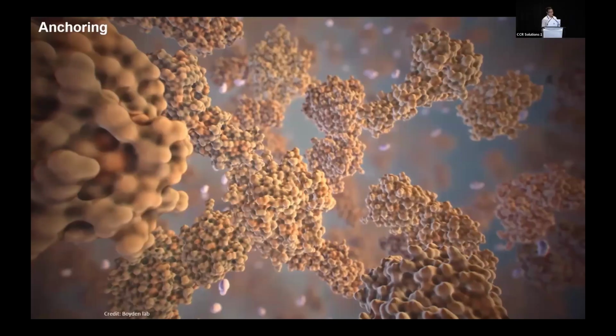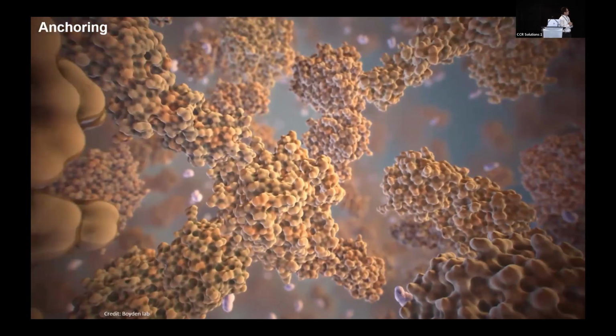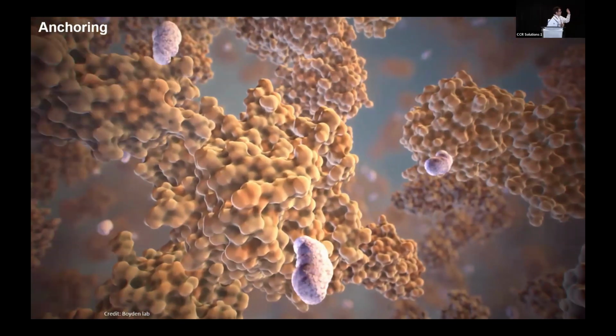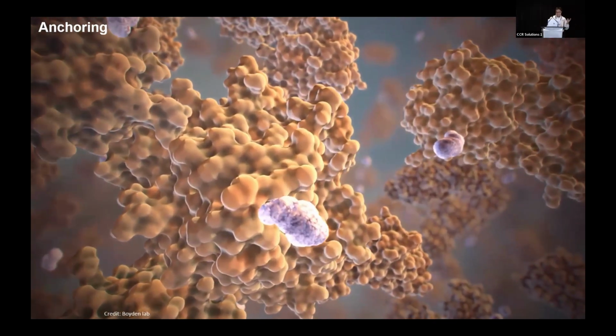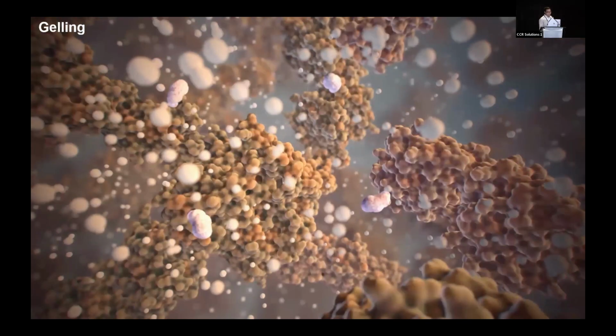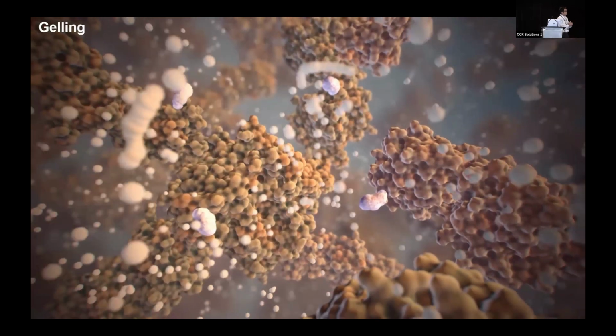And then I can show you an animation. I stole that from Ed's talk. So basically, you have this tissue molecule with this small chemical approach them and react with them. So they have this chemical handle. With these handles, the tissue or the cell sample are submerged into the gelling solution.